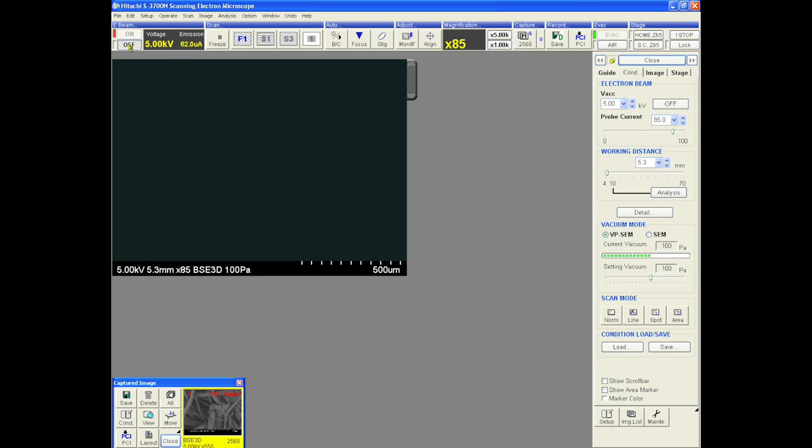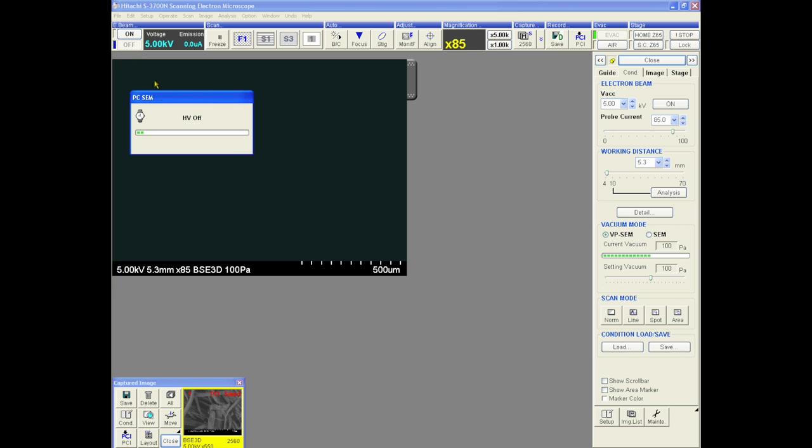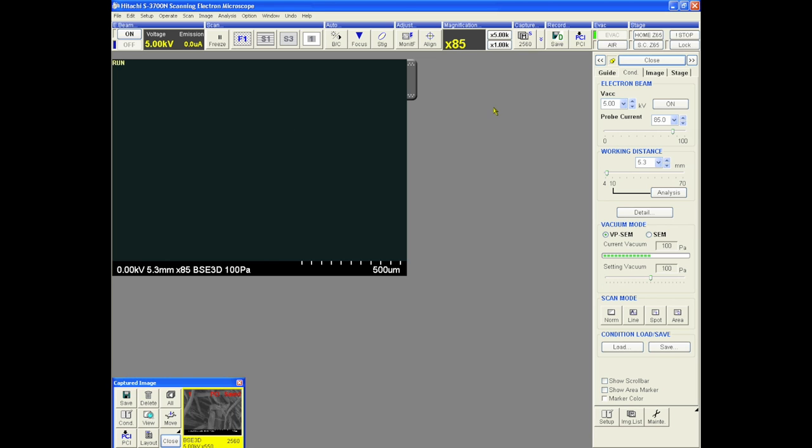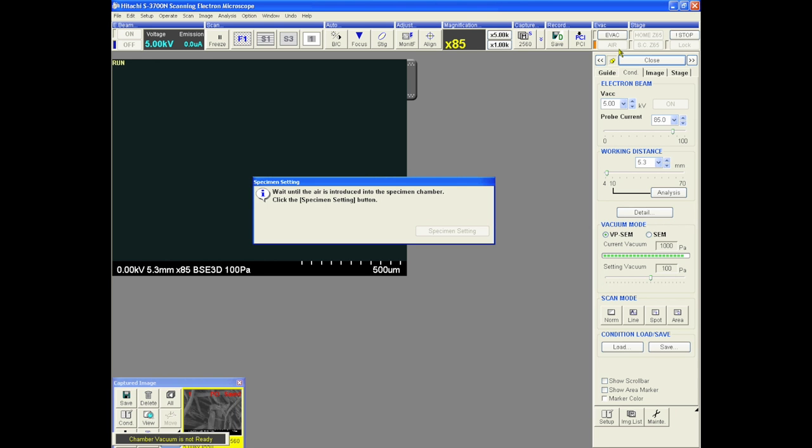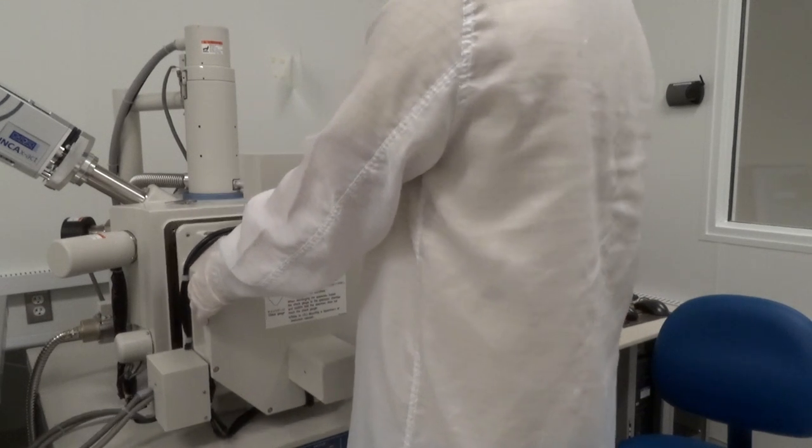When you are finished capturing images, turn off the E-beam, set the sample to home Z65, and vent the chamber. Once the chamber is vented, remove the sample and pump the chamber back down. Keeping the chamber under vacuum prevents moisture and debris from building up inside the chamber. Once the chamber is evacuated, you may leave and continue on with your day.